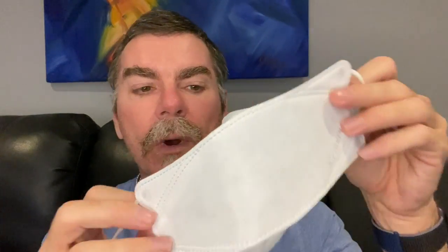Now this is the Airqueen and I want to show you the difference. It's got this panel at the front and then it has these two leaves — one at the bottom and one at the top. So it opens out like a clam and it fits across the face slightly differently. That goes underneath the chin, this goes across the nose, and you can see that there's more room for the nose.